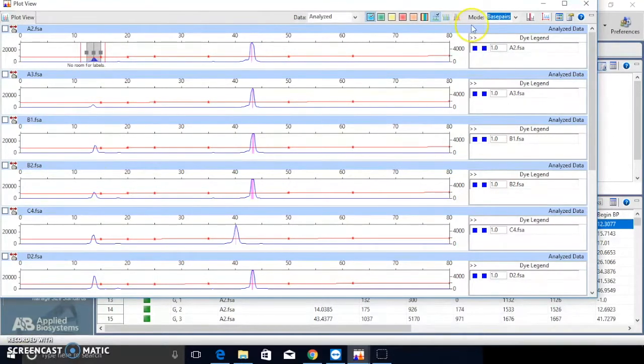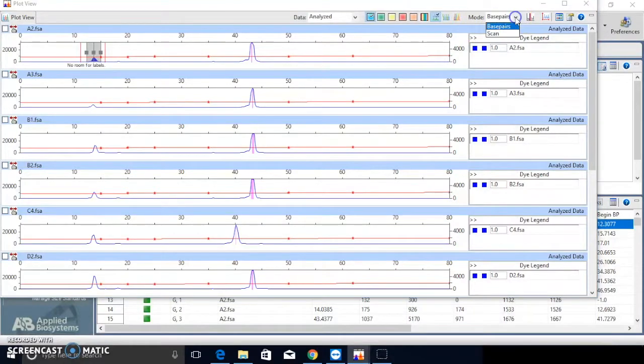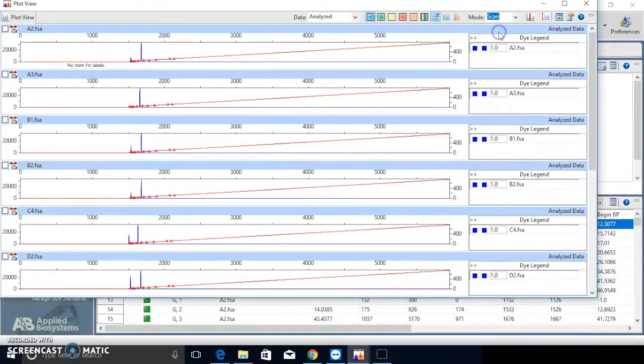You can also switch the view to scan mode. It might give you more useful information for some cases.